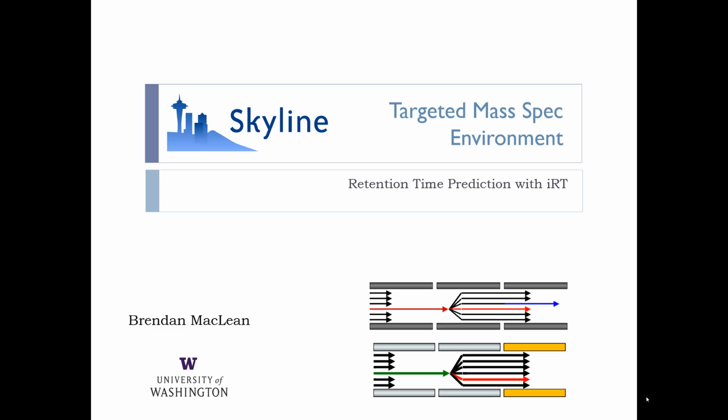You should learn enough, certainly to use a standard that you purchase, but also even to calibrate based on endogenous peptides. Lindsay said there are these standards, and there's a growing number of them. It seems that anytime any company creates one, they contact us and try to get it into Skyline, and we're happy to put them in Skyline. So there's a growing list that we'll look at in a moment. We'll see how long it is.